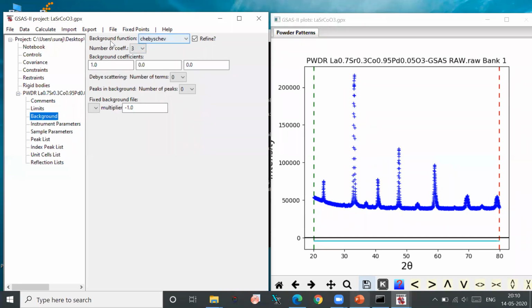There are many background correction and refinement functions. The popular one is the Chebyshev. I suggest that Chebyshev is the right choice for our Bragg-Brentano type of detection. Our powder XRD has mainly two types of incident X-ray focusing: one is parallel beam, and another is Bragg-Brentano.